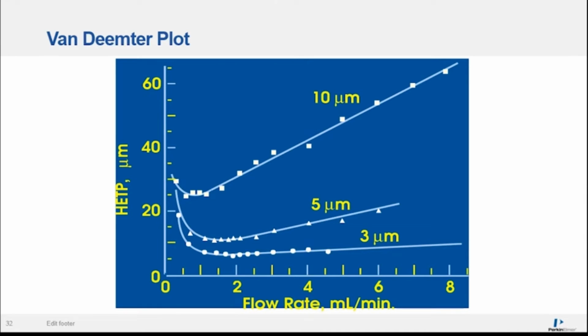You can change the flow rate and it will get worse or faster, but it will never get better if your flow rate is set at a minimum. Again, the power of LC is in the mobile phase composition, not in changing flow rate.